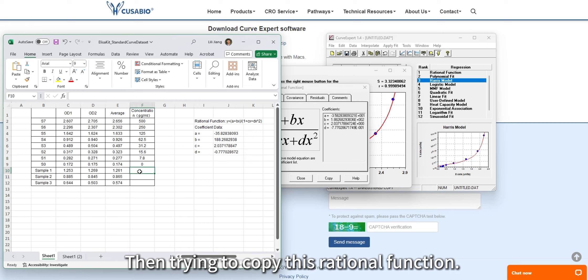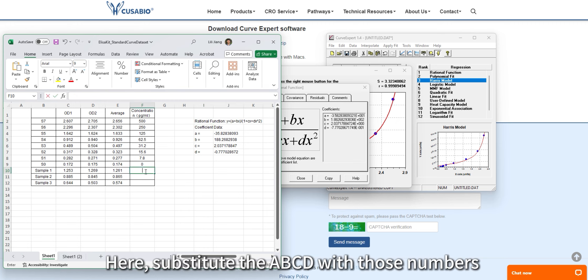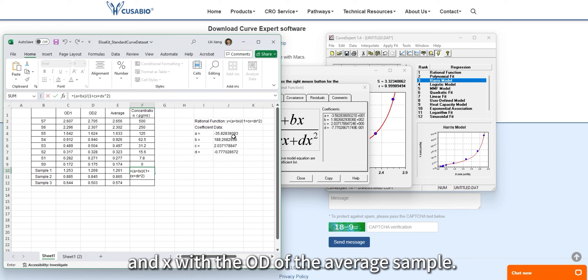Then copy this function. Substitute A, B, C, D with those coefficient numbers, and X with the OD of the sample average.